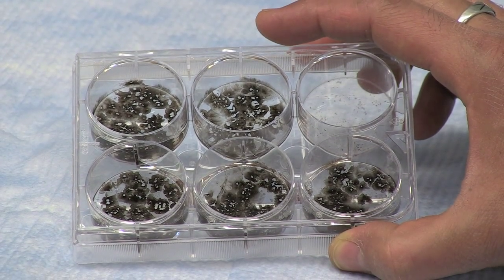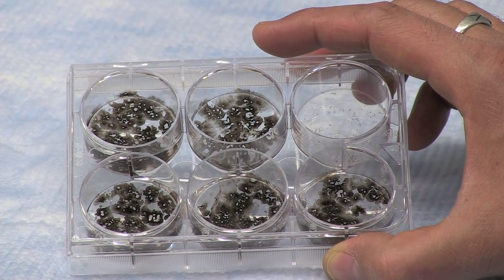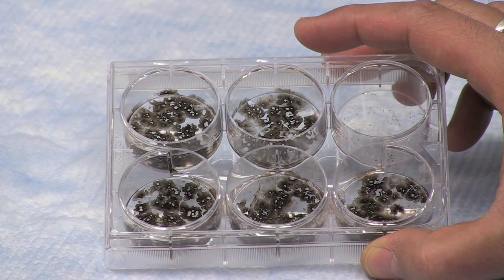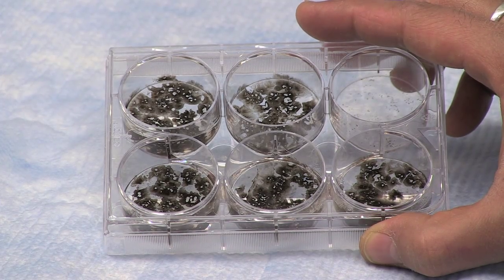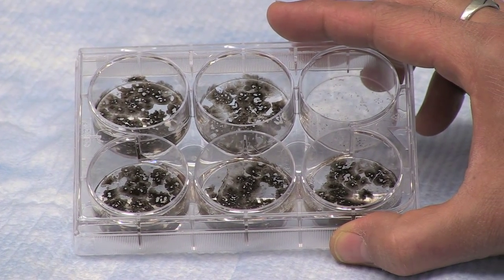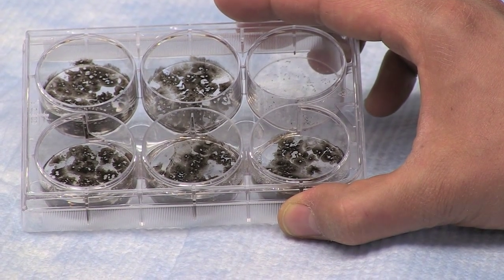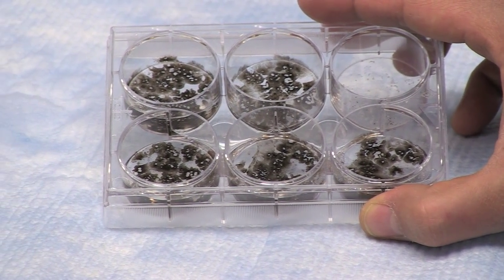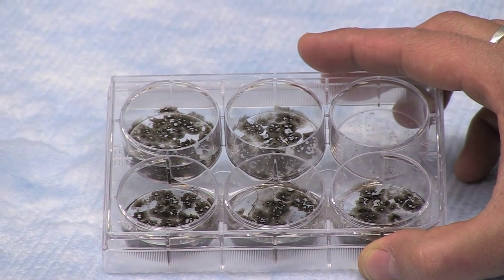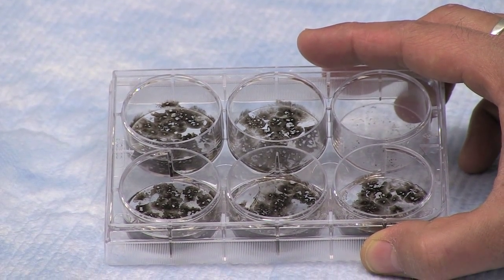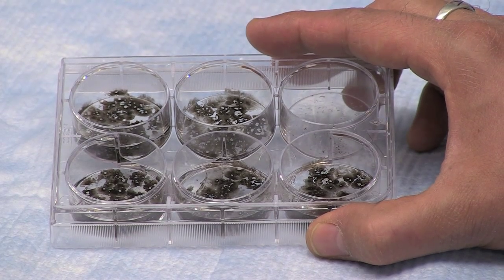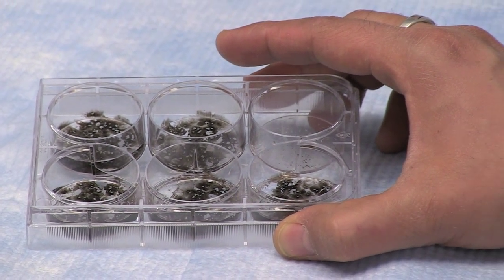And this is one typical example of a dish where we have made RPE cells from IPS cells. And you can see that all the wells are full of pigmented cells, that you can see this black color here, which are all RPE cells. And if you do FACS analysis to check how pure these are, you can easily get more than 90% RPE cells from any given well at a point.